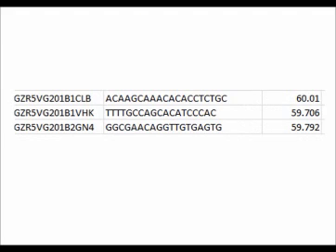Looking at the data here, we can see we've got a bit of a problem with the second microsatellite down, the one that's VHK on its code. You can see that the primer there has got 4 T's in a row. The first 4 bases in that primer are 4 T's, which would mean we would eliminate that microsatellite from our list. Okay, so now our list of microsatellites that we could potentially use is getting much smaller.